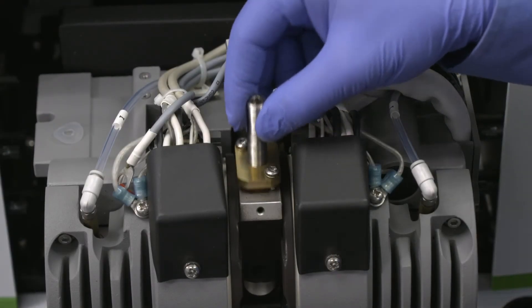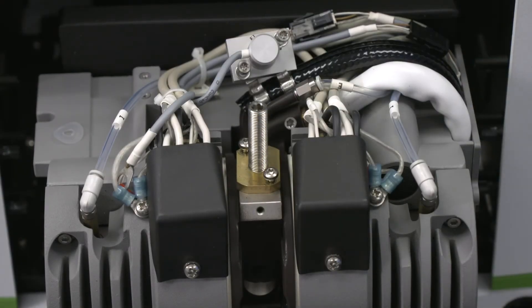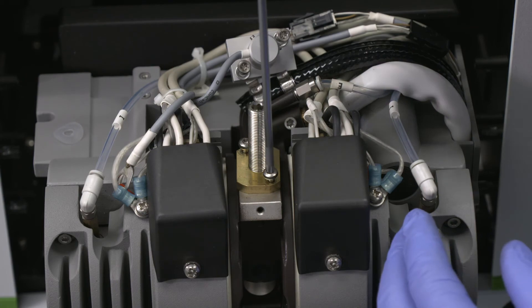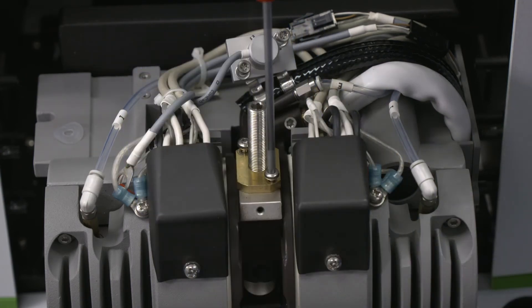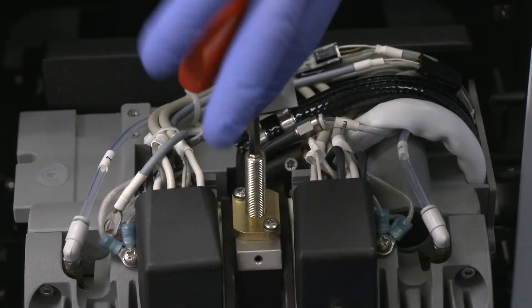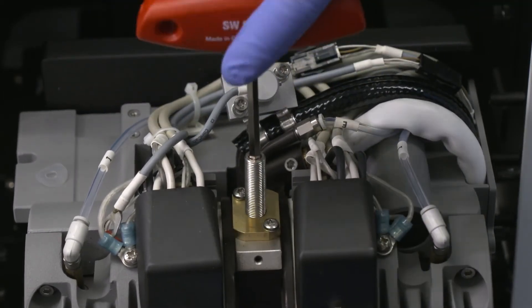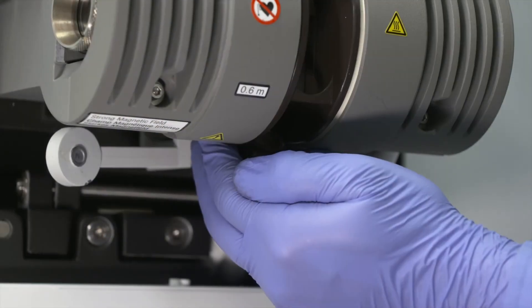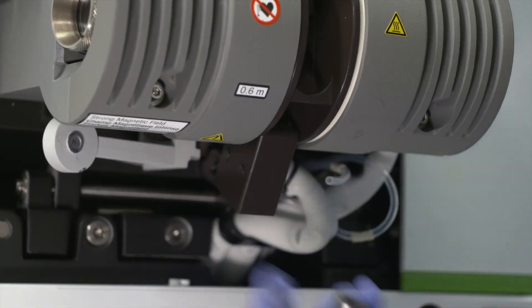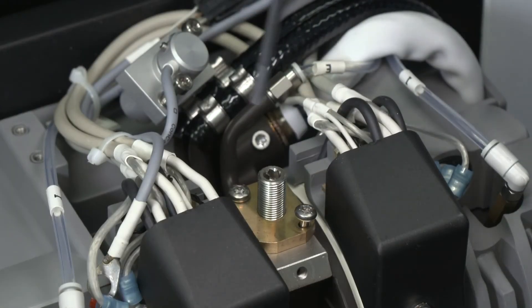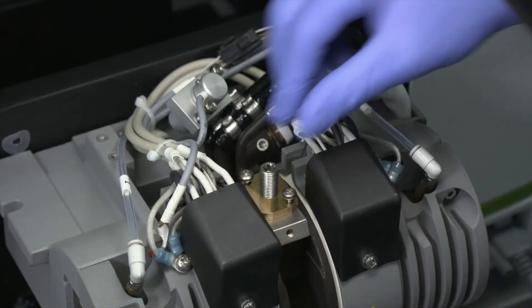Now, attach the removal tool to the rear contact housing with the two captive screws on the tool. Use the hex driver to screw the bolt on the removal tool into the tool to push out the contact, and then unscrew the two screws that secure the tool to the contact housing and remove the tool.